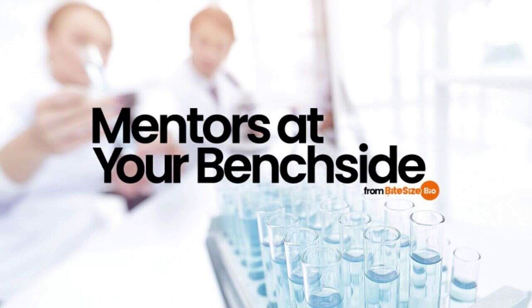Number 4, undergrowing cultures. While oversaturation is a problem, the undergrowth of cultures is also problematic for plasmid yields. You can mistakenly undergrow a culture by using old colonies from plates or starting directly from frozen stock and not from a colony. The lag time for the bacteria to ramp up is much longer when you use either of these approaches.